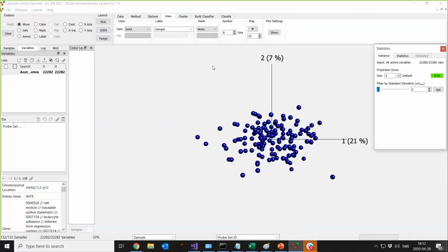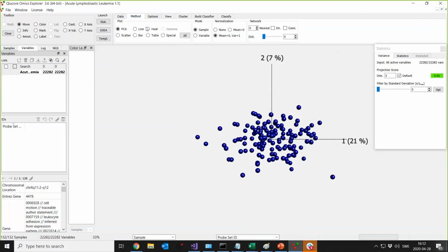Now, I can express my data in so many different ways. Different plots for different purposes. For example, the three-dimensional PCA plot is very powerful for human exploration and playing around with your data. However, it's not as good for publishing in a publication. If you want to do that, many publications usually ask for certain types of plots. And one type of plot which is very common in many publications today is heat maps.